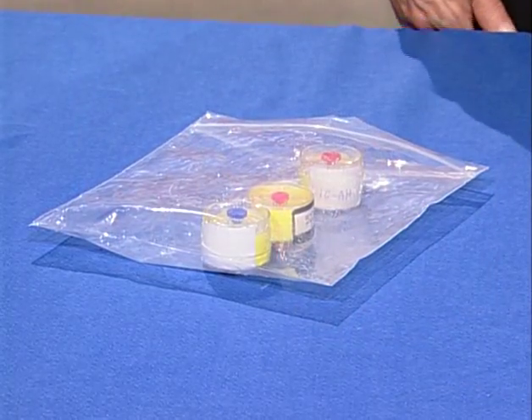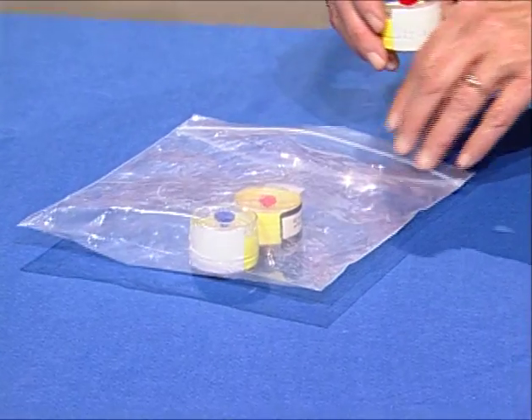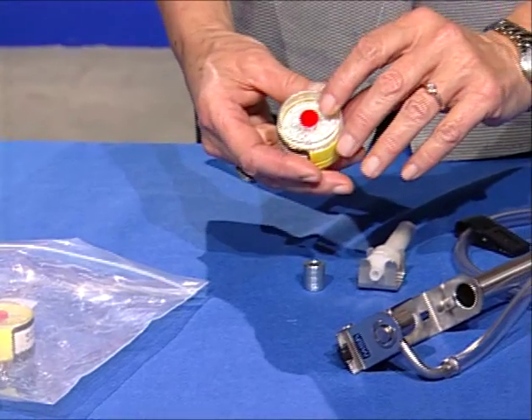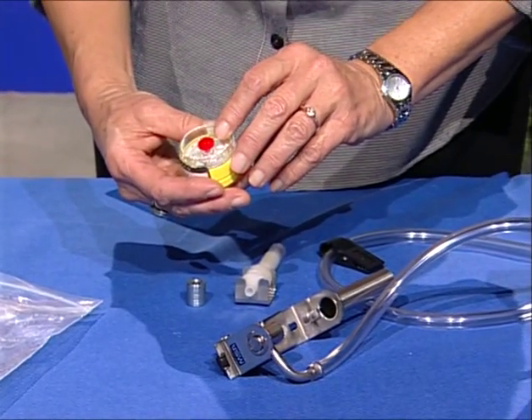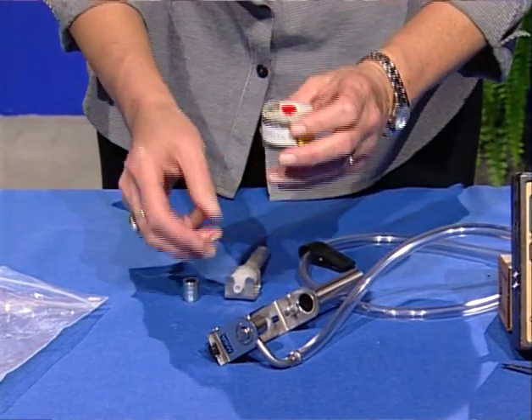The next step is to remove the cassette from its protective bag. Examine the filter in the cassette housing to make sure the filter is flat and not crimped in the housing. It must be placed correctly on the cyclone for proper sampling.